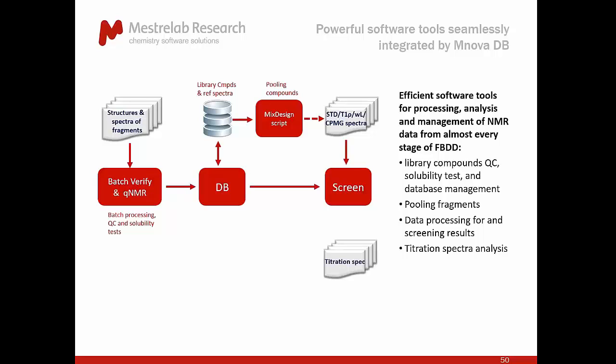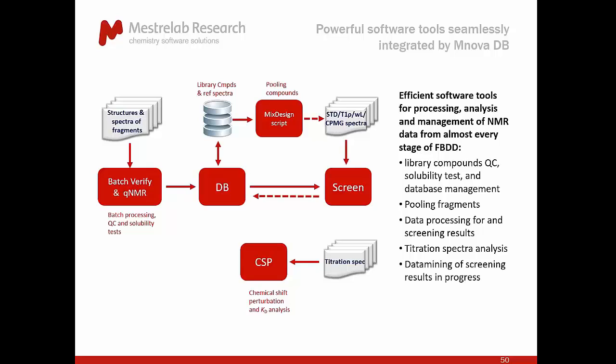And then if you're using titration of these spectra, we have CSP for this kind of batch processing, automatic analysis, plus manual correction, etc. All those results can potentially be saved into another database for future data mining. Of course, that's something we're still working on, in progress.